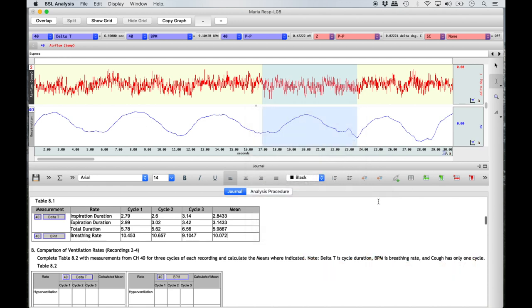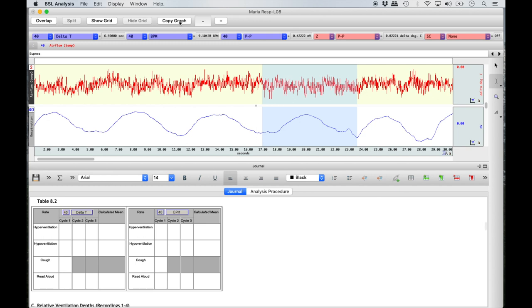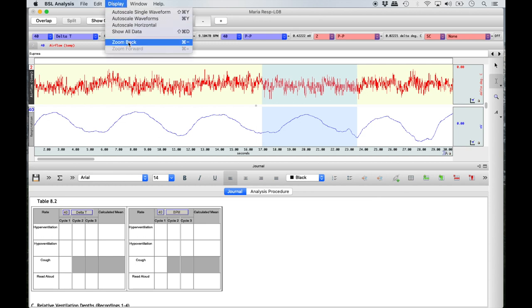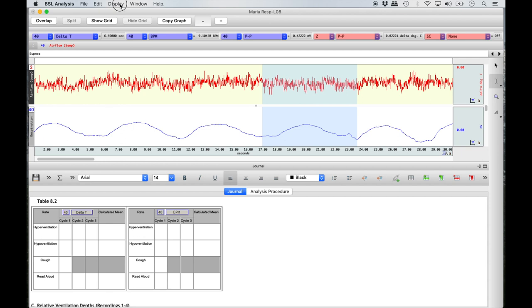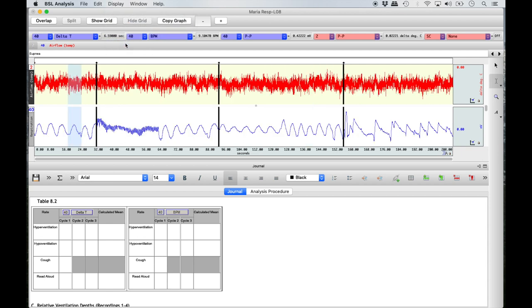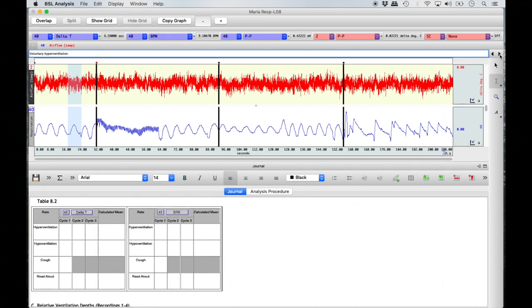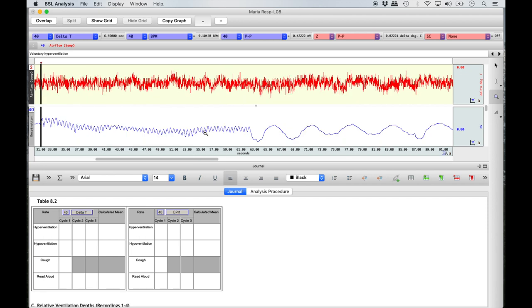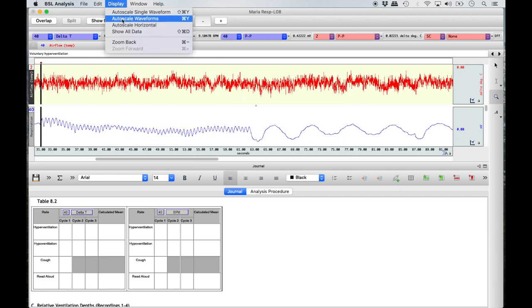Once Table 8.1 is complete, scroll down to Table 8.2. Select Display from the top menu bar and then Zoom Back. Select the right event arrow and ensure that Hyperventilation is listed in the top text box so you correctly identify the next recording. Using your magnify tool, drag a box over the entire hyperventilation segment, being sure not to cut any waveforms from view.